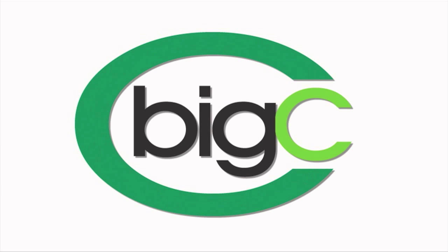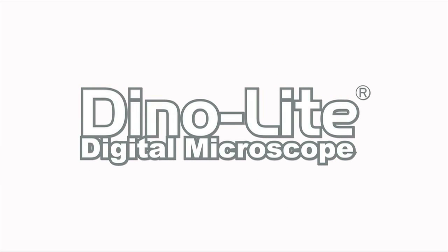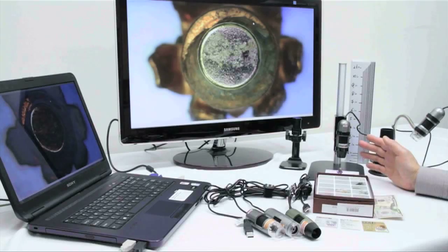Introducing the AM4013FVT. This microscope features 8 LEDs set to 395 nanometer wavelength.